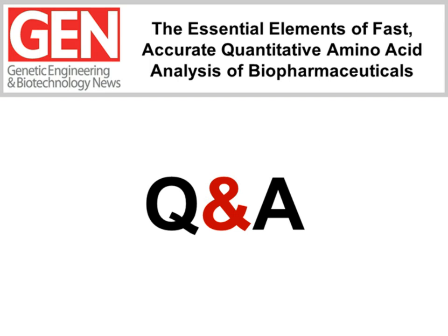Our best source of that kind of experiment, of course, is a purified protein where we know the sequence and therefore we can recognize the expected amino acid composition. When we do that, we introduce all the variability not only from the amino acid analysis method, but anything in the hydrolysis and other sample handling. When we have done that on a reasonably careful basis, we typically are better than 5% agreement for all the amino acids.